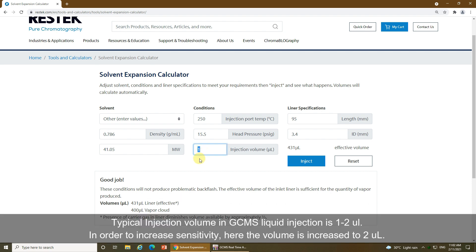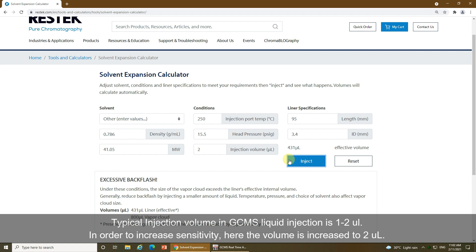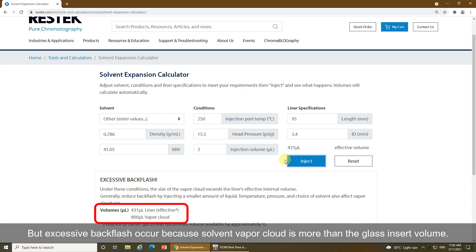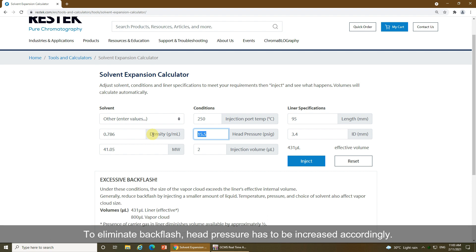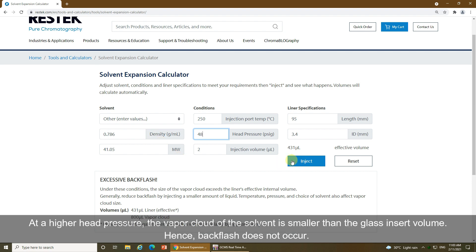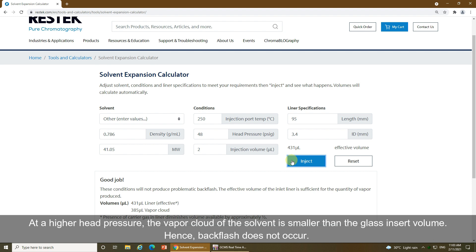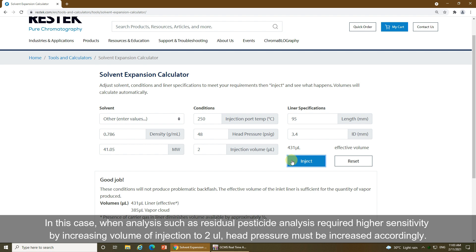Typical injection volume in GC-MS liquid injection is 1 to 2 microliters. In order to increase sensitivity, the volume is increased to 2 microliters. But excessive backflash occurs because the solvent vapor cloud is larger than the glass insert volume. To eliminate backflash, head pressure has to be increased accordingly. At a higher head pressure, the vapor cloud of the solvent is smaller than the glass insert volume, so backflash does not occur. In analyses such as residual pesticide analysis requiring higher sensitivity by increasing injection volume to 2 microliters, head pressure must be increased accordingly.